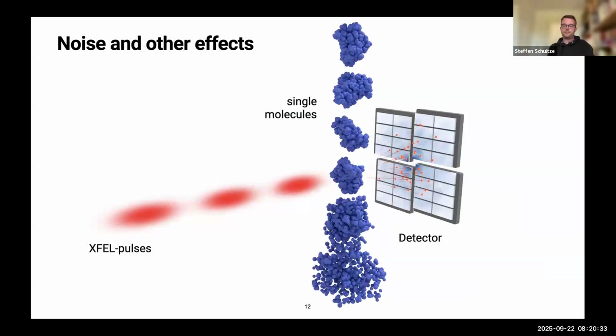But of course, this was quite idealized data. So only coherent scattering, no background, and no other nuisance parameters. In reality, of course, it's much more complex. There's always going to be some other gas in the beamline. There's solvent, maybe evaporated, maybe sticking to the protein. Actually, the pulses fluctuate quite strongly in strength.